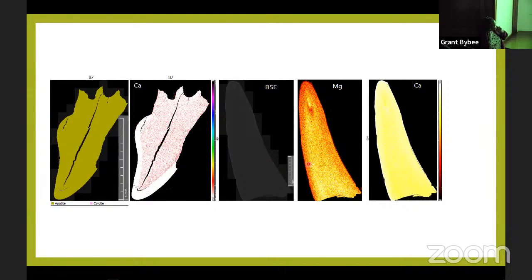And here it doesn't show now, but this one is an animal tooth, is what you're telling me. And you can see here the patchy zoning of the magnesium and the calcium. So you explained to me that the reason for this, he thinks, is because humans lose their tooth, but animals, their tooth grows progressively. That is why it shows this zoning.